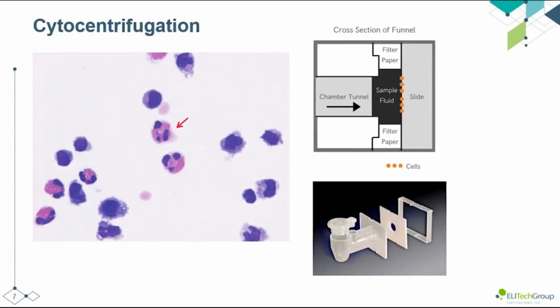While talking about body fluids, we should note that many of the fluids that are tested in a laboratory will have a very low cellular concentration. Instead of hunting around a slide all day for the few cells that may be there, most laboratories will perform a cytocentrifugation of the sample. There are many different methods of cytocentrifugation, but they all share the same concept.